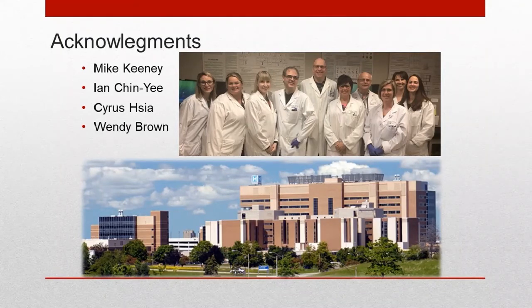So it will affect your compensation. So all things equal, you could run them with the same settings. Would it require a little bit of manual adjustment? More than likely, if you have used a very different fluorochrome. If you use something that is substantially brighter, then it could affect the compensation that you have.